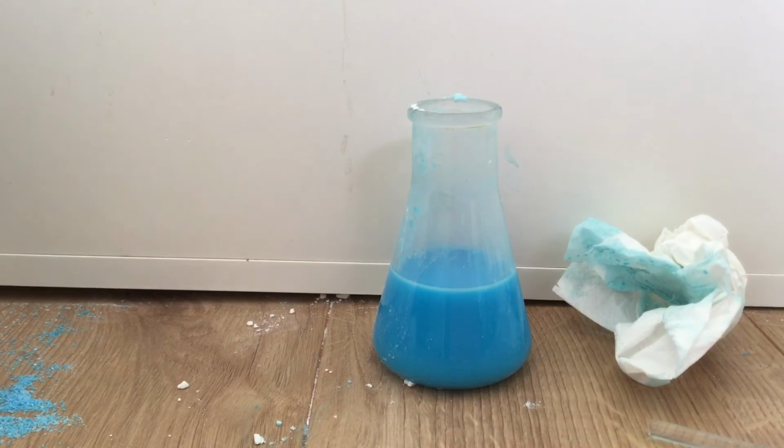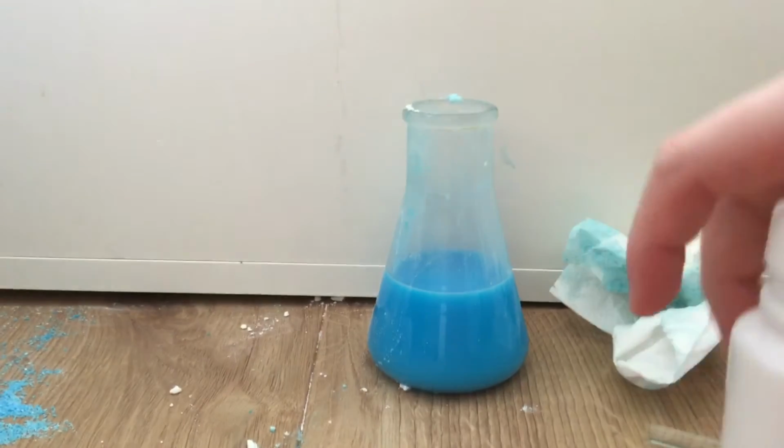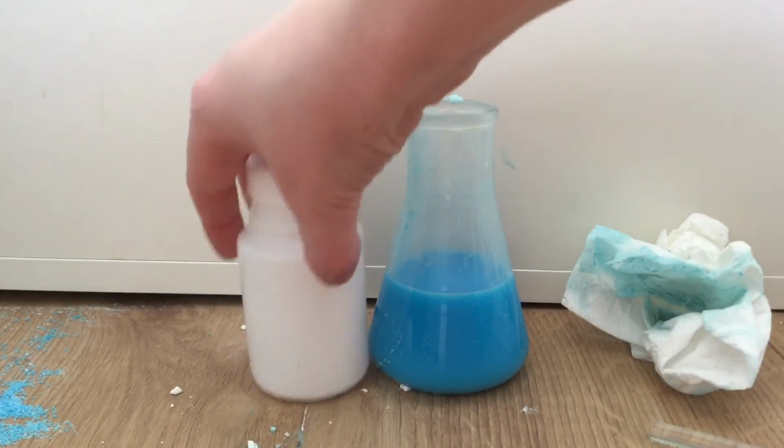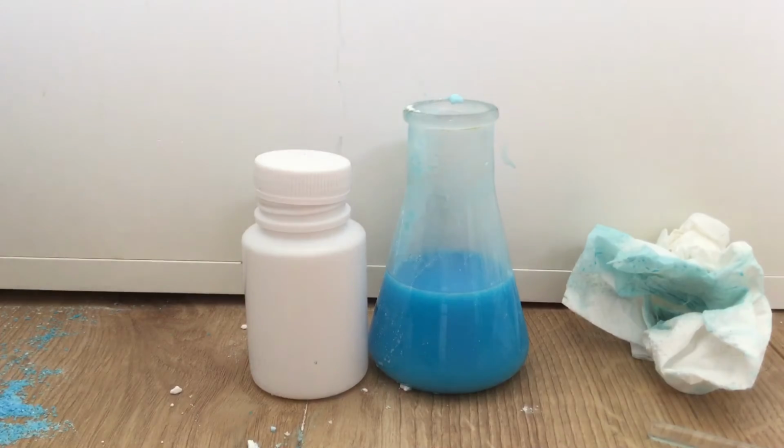Now I need to get a beaker or any other sort of container. This would actually work. This little pill jar. But you need to get some filter paper. Coffee filter would work too.